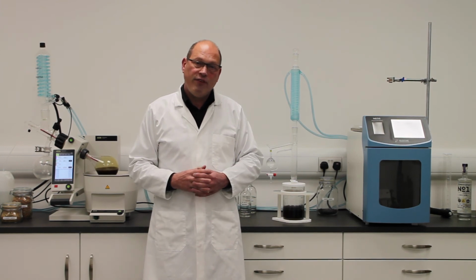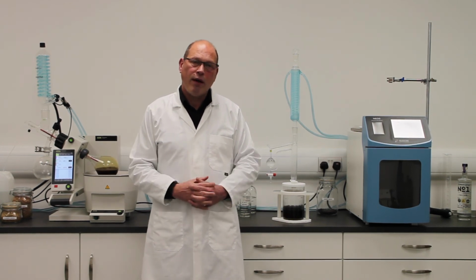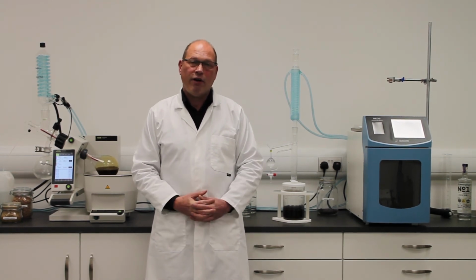done on a 75 litre scale, where they're extracting rosemary. And it's a similar apparatus to collect the essential oils as I'm using here, and you can see how incredibly efficient it is.